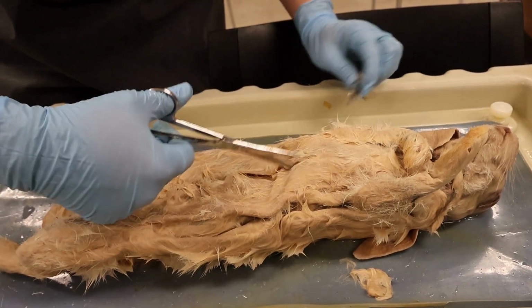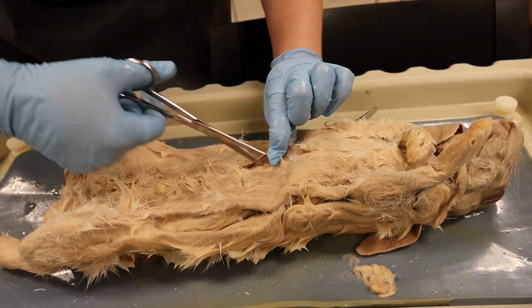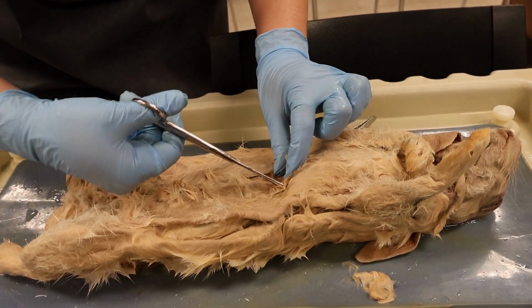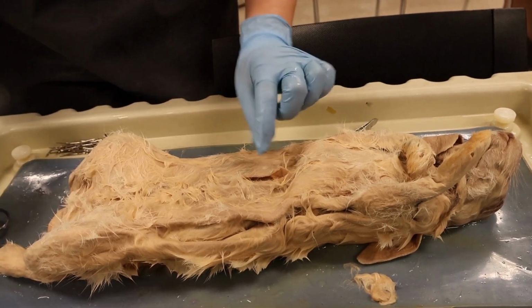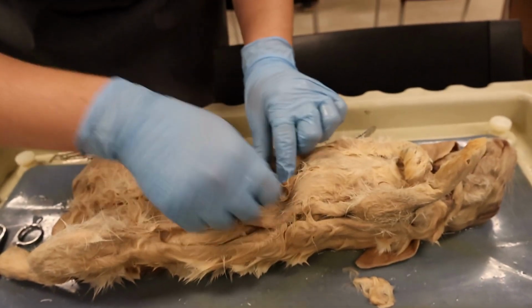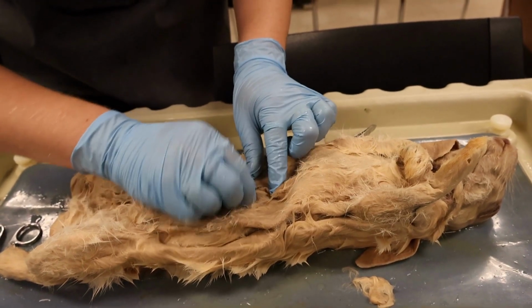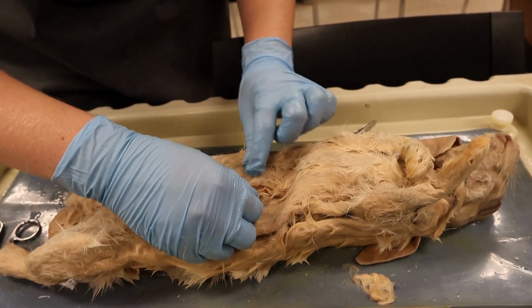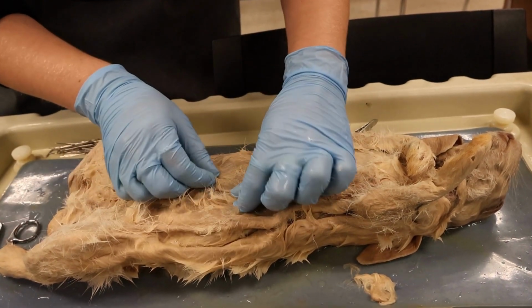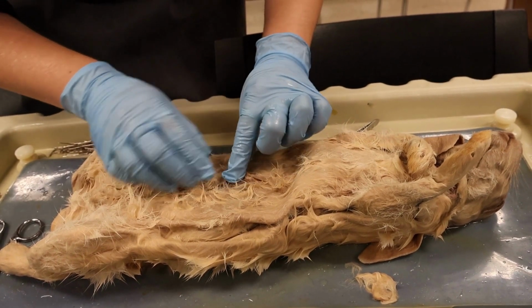Both of these are incredibly crucial in maintaining body temperature regulation in mammals. Especially the hair, it has internal insulation and a cooling element to it. So no matter the season or the high or low temperature of the environment the rabbit is living in, it can regulate its body temperature, as well as the temperature its internal organs need to maintain homeostasis. The skin is also an external layer that protects the internal organs, along with being a body temperature regulation mechanism.